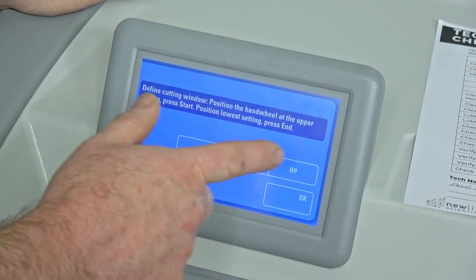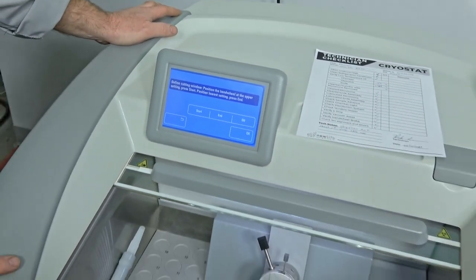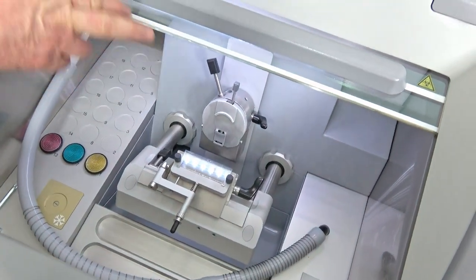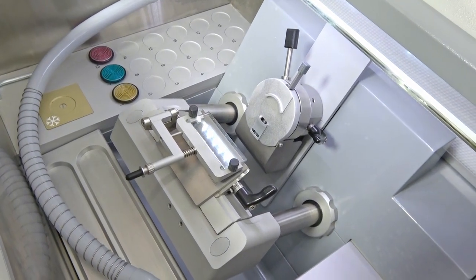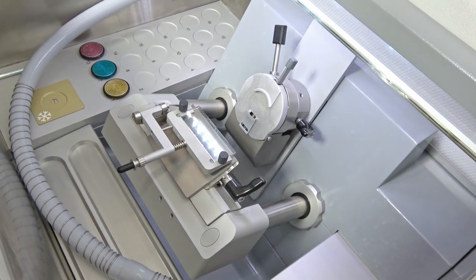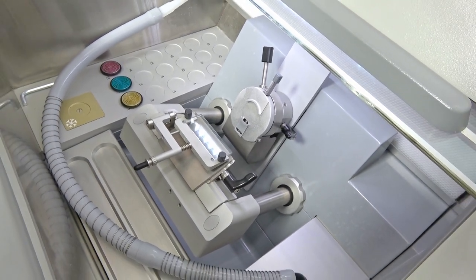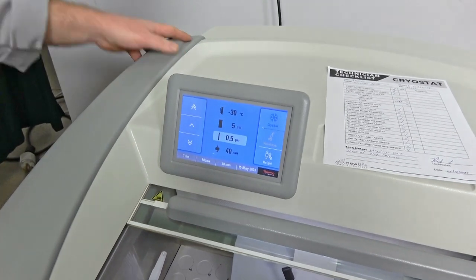If you want to use the vacuum tome, this is the window setting. It's very easy — you just set where you want to start your cut and hit start, then go to where you want to end the cut and hit end, then press okay. That sets your window for your cutting, so it's very easy to set up and run.